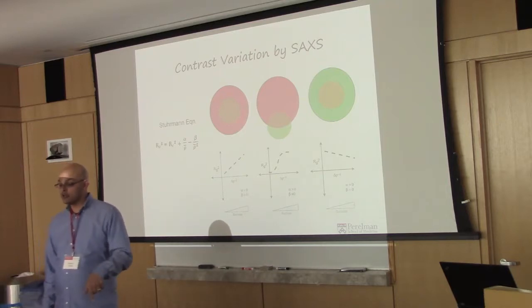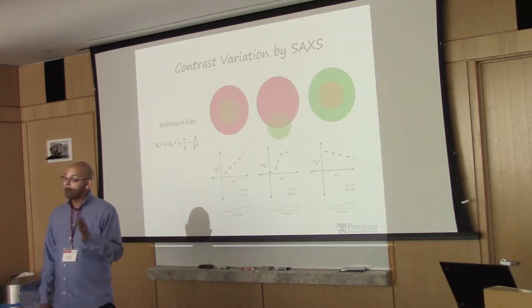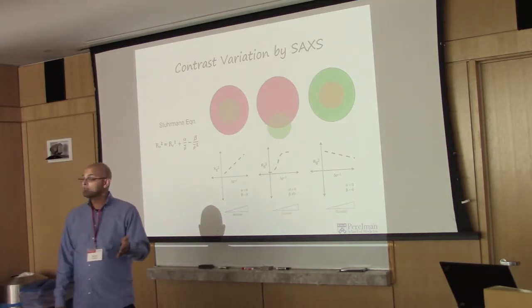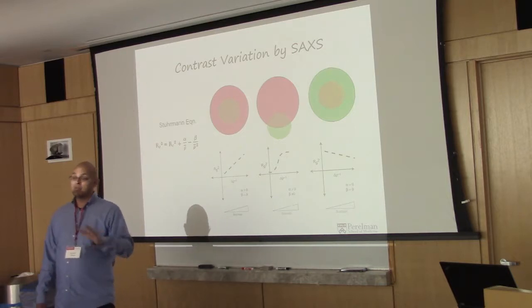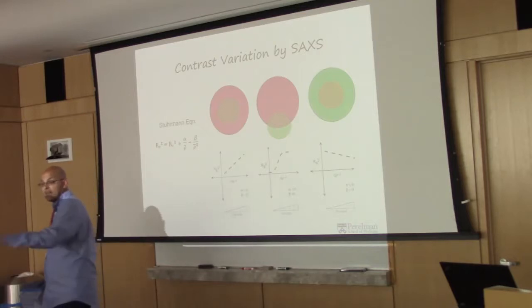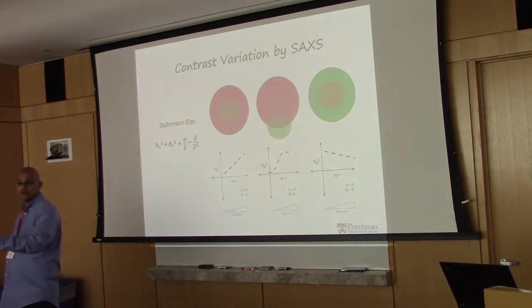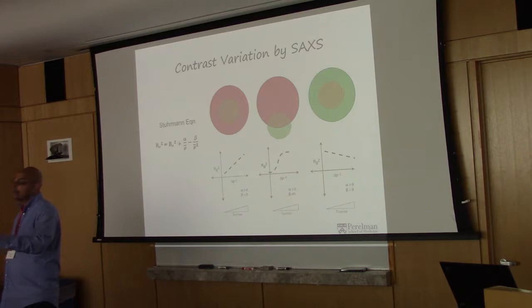Those beam lines are generally oversubscribed two to four fold. It's very competitive to get beam time to do these experiments. They only have cycles maybe twice a year, so you have to be very patient. Sometimes you can't get access to neutrons right away in the way you might need, or you don't have enough sample. Neutron experiments need a lot of sample: 350 to 700 microliters in these quartz banjos at a time to do the solution measurement. Sometimes that's not realistic in systems that don't express well.